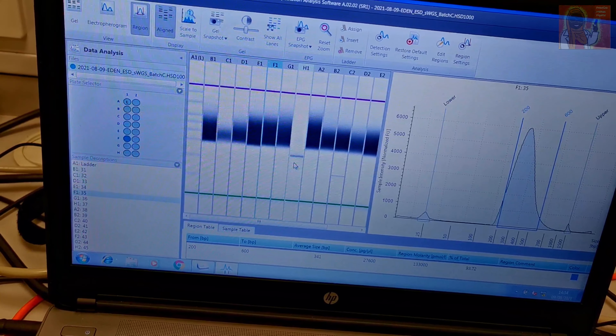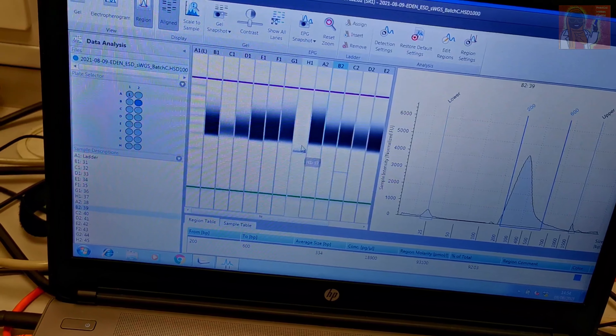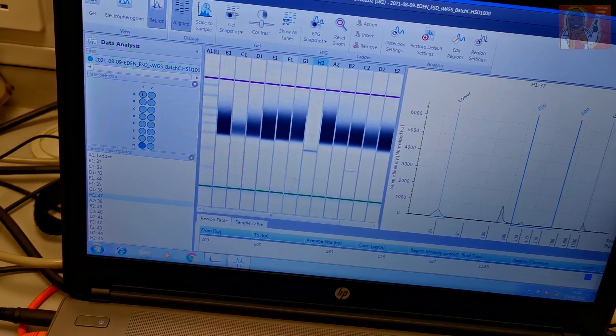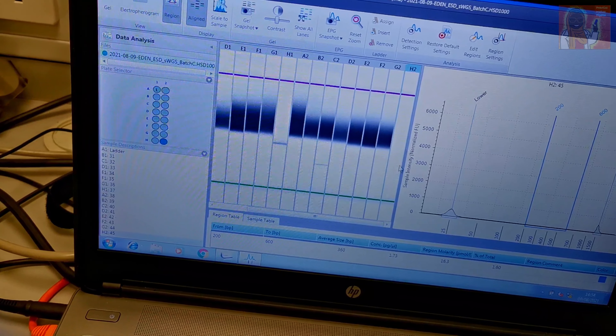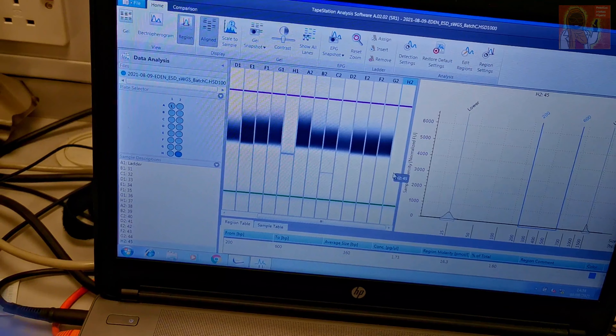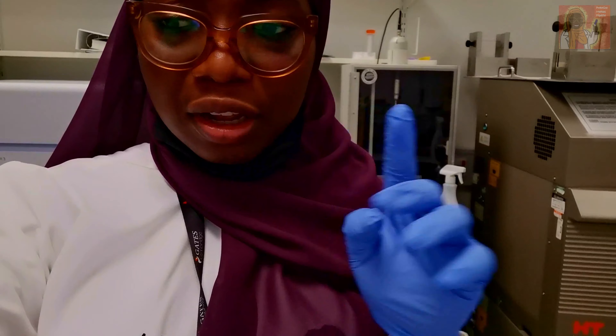You can see that the samples look a lot cleaner — there are no extra bands in these ones compared to yesterday's, where I told you there could be primer dimer contamination. However, I have no sample showing here for one, and apparently no sample for another either. I need to remake those samples tomorrow — sample 35 will be included in my next batch of 15 samples. There are also one or two samples that appear burnt that I'll probably have to repeat primer dimer purification on at some point.